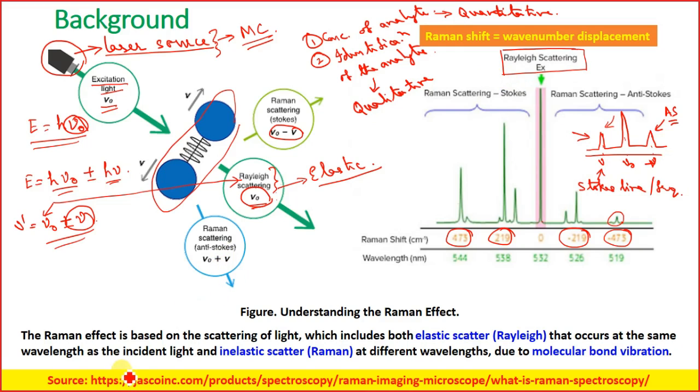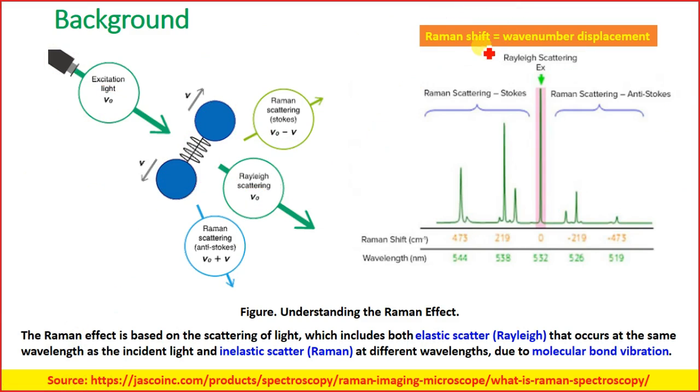Just like the previous spectroscopic techniques we have discussed till now, Raman spectroscopy can also help us in qualitative and quantitative analysis of the analytes. If you see these peaks, the height of these peaks can provide us information about the concentration of the analyte in a particular solution.